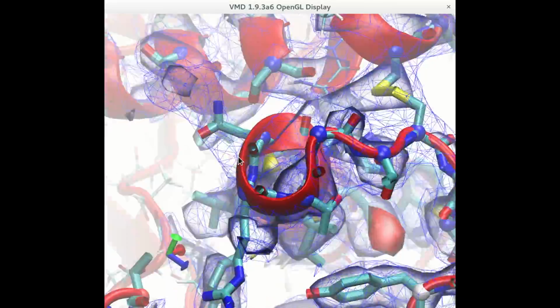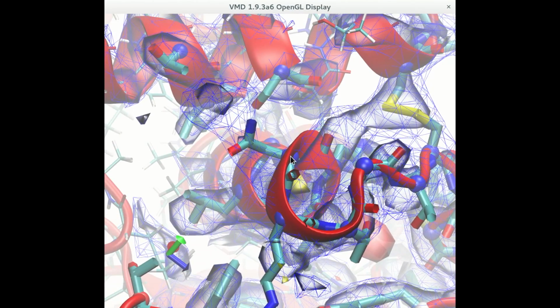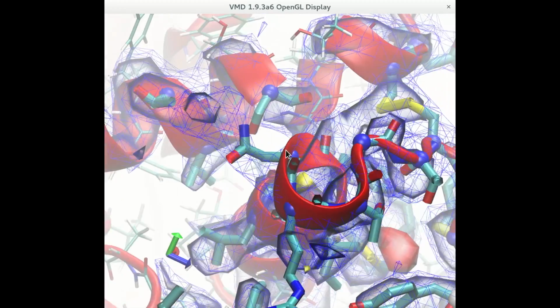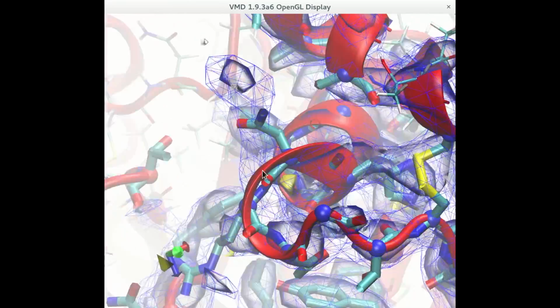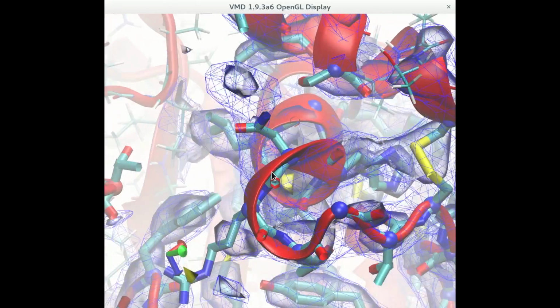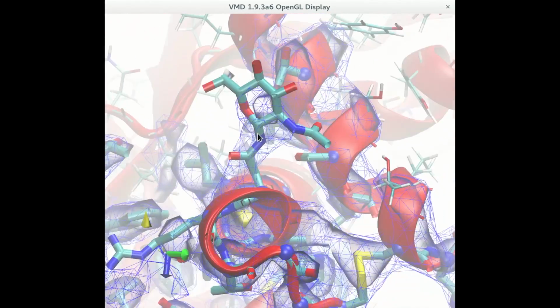Here's an interesting feature I came across during my detailed check, an asparagine residue with a significant blob hanging off it. The sequence here is asparagine arginine threonine, and this is an extracellular protein. Sure enough, UniProt lists this residue as glycosylated, so let's add the N-acetylglucosamine.